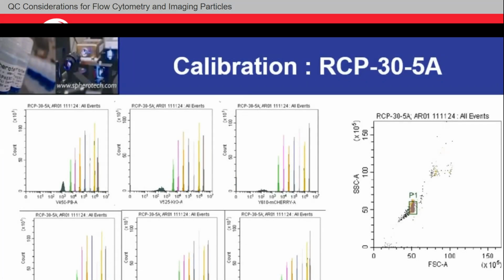Maybe they want to do it in FITC. Maybe they want to do it in a violet channel. They have very high resolution. If you're not fully aware of the capabilities or resolution that you have in your instrument, you may have false assumptions or hypotheses. So sometimes seeing an artifact is more true than masking one. But again, these tools are extremely robust.